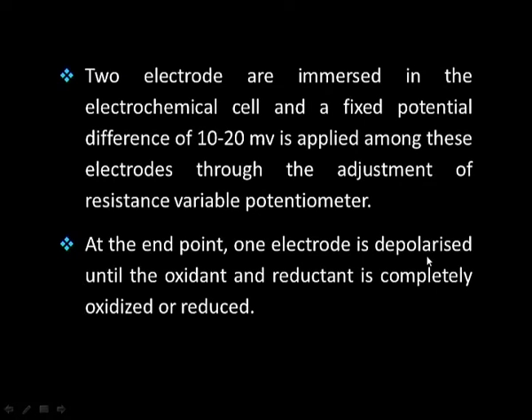At the end point, one electrode is depolarized until the oxidant and reductant is completely oxidized or reduced. The example is Karl Fischer titration, in which the amount of water or moisture is determined.